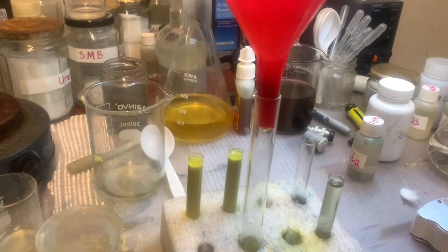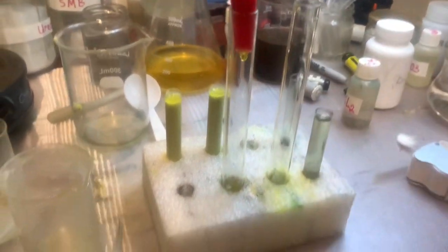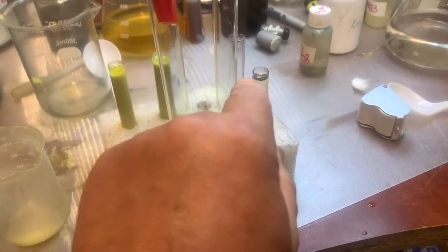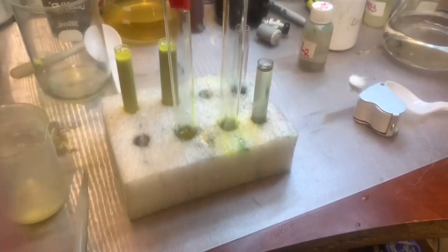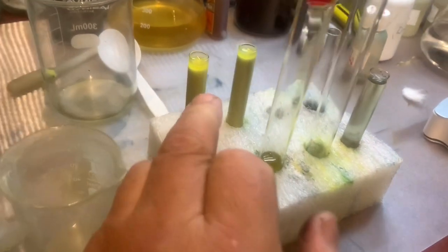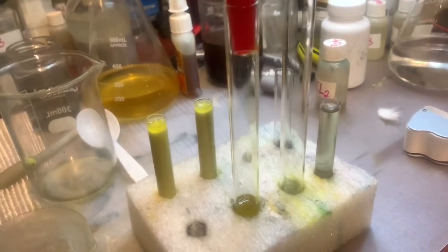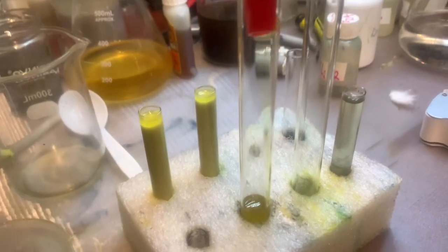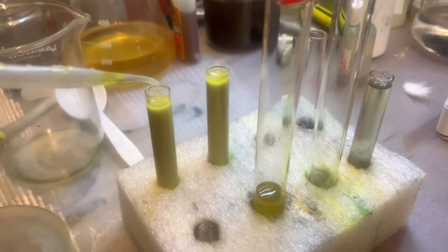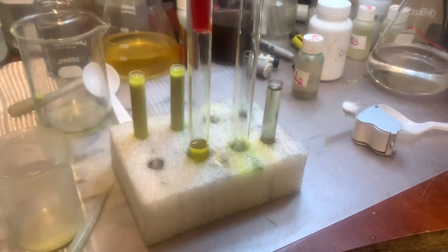And one more time filtrate. The same filter. And we'll see what's happening. I let it go till half, and then I transfer back into this one. Okay. This filtrates. Now those ones are settling down, but very slowly. It's not a lot. I did a good job separating those. Forget it, let it settle down. I'll do that tomorrow off camera.